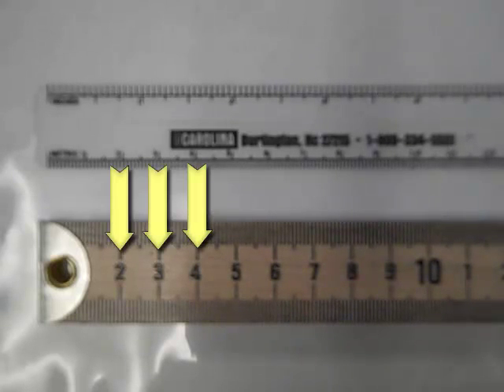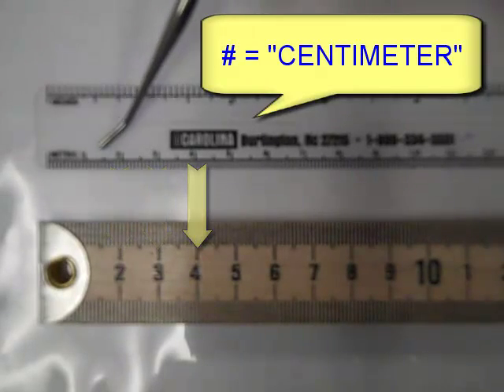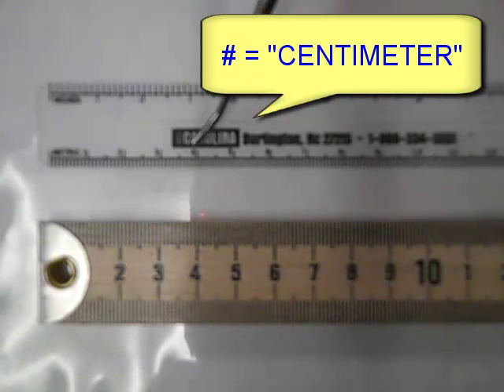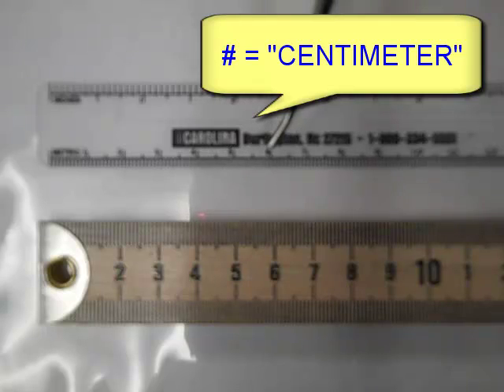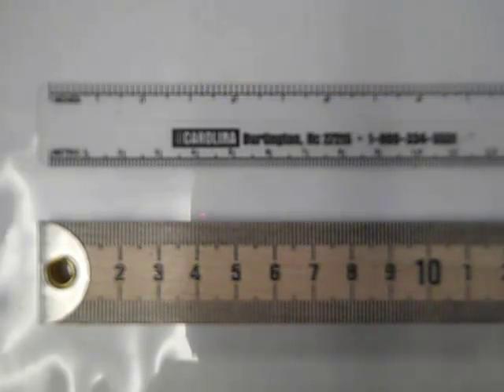Anytime you have a printed number on the ruler, 1, 2, 3, 4, 5, 6, etc. Those are the centimeters.